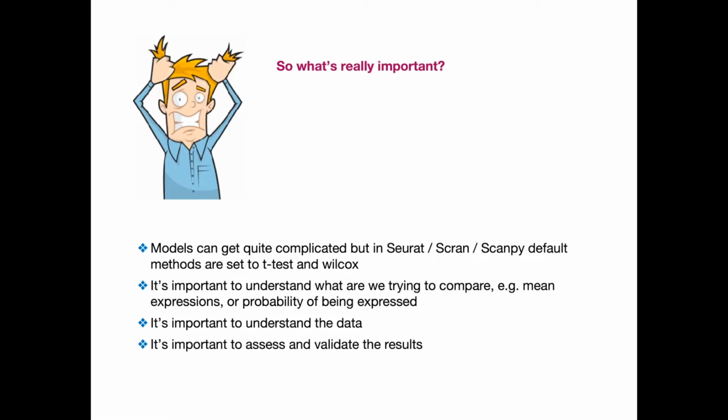Also, most of these tests give very similar results when it comes to the top genes, but the p-values might differ exactly how they calculate it. So when you do a cutoff of a specific p-value, you might get longer or shorter gene lists depending on what test you run.